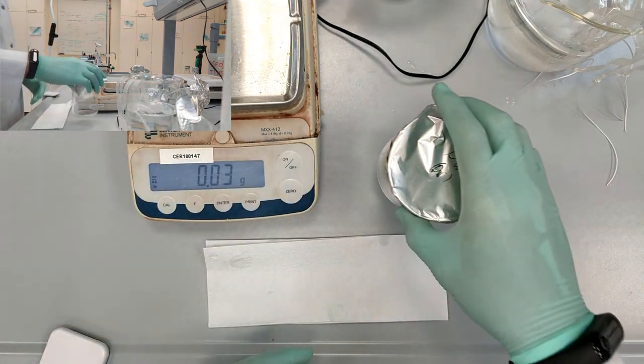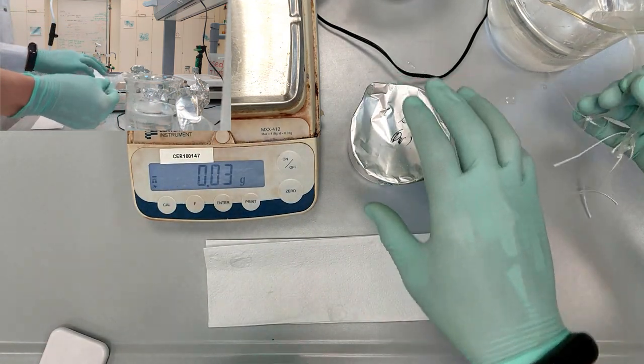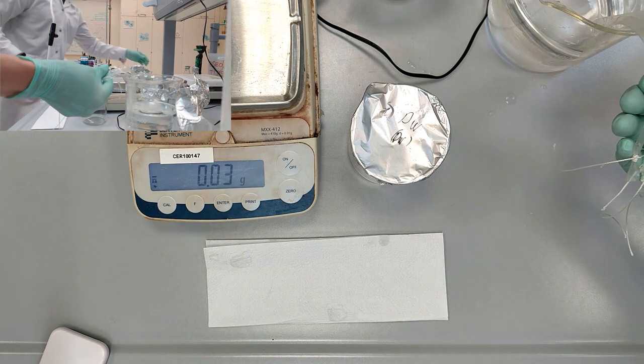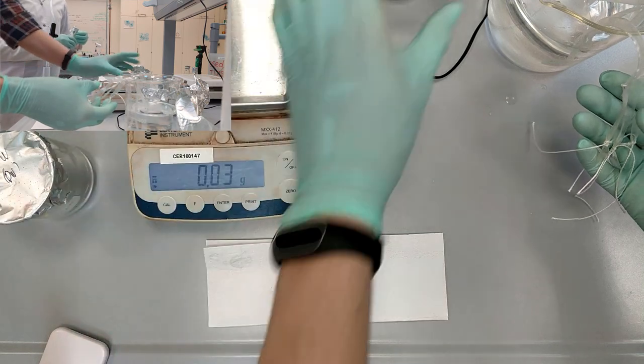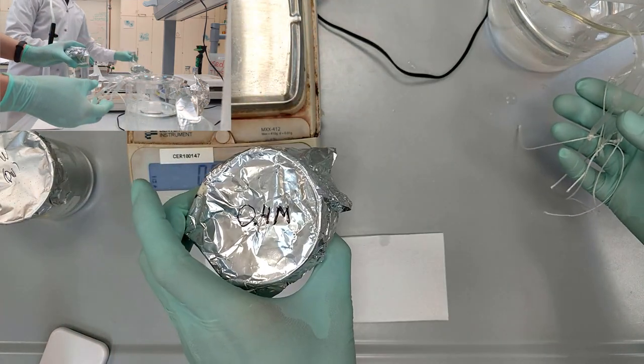Now we are going to prepare the dialysis tube with distilled water inside. It will serve as the negative control for our whole experiment.